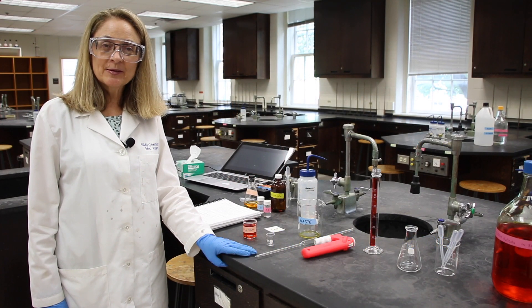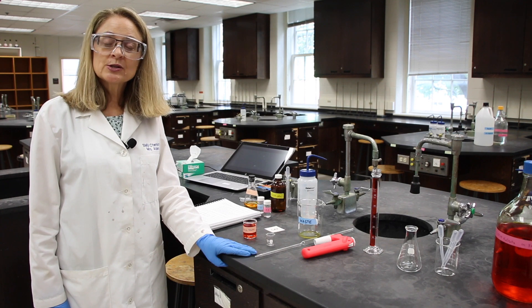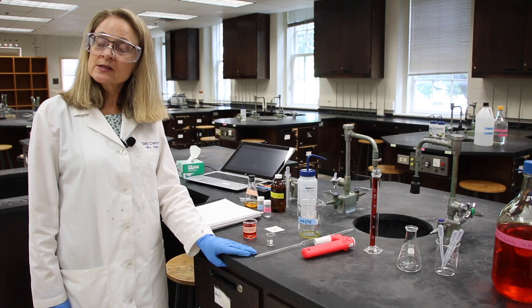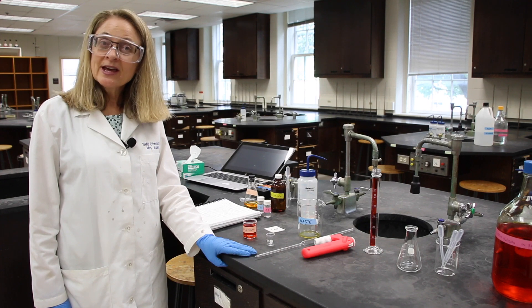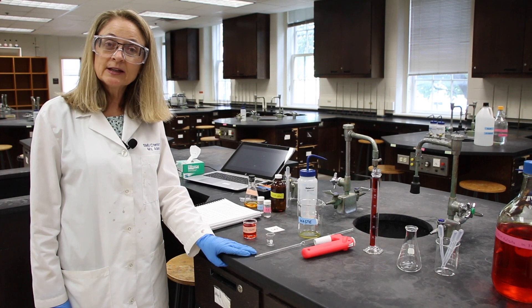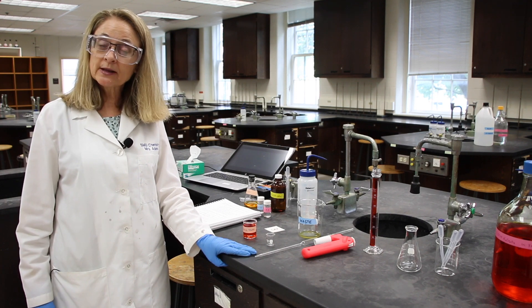Hello and welcome to lab. Today we're going to do experiment three, stoichiometric calculations and graphing. The experiment we're going to do today is the basis for many breathalyzer tests. I'd like you to follow along in the lab manual and I'd like you to be my lab partner.